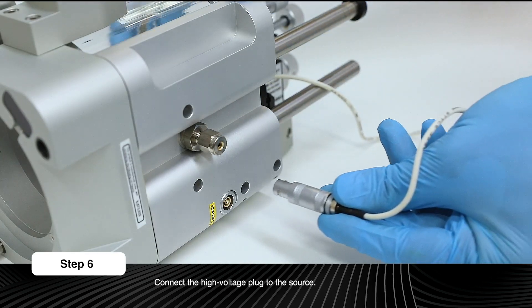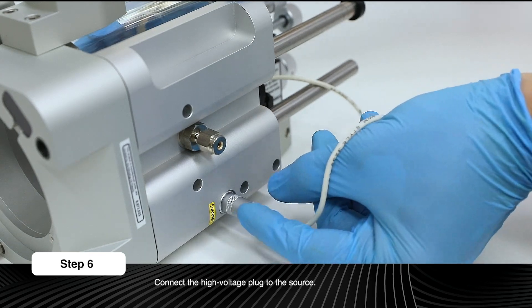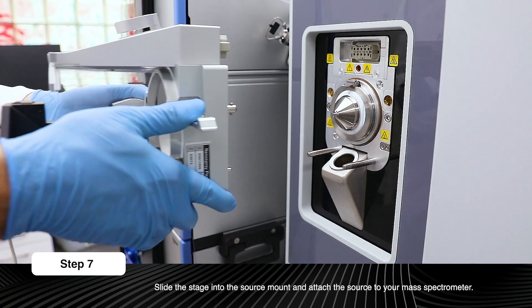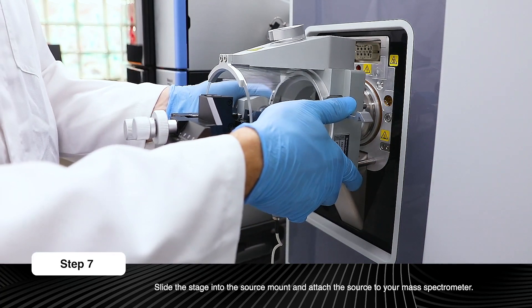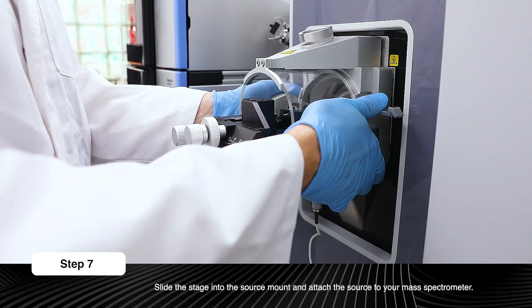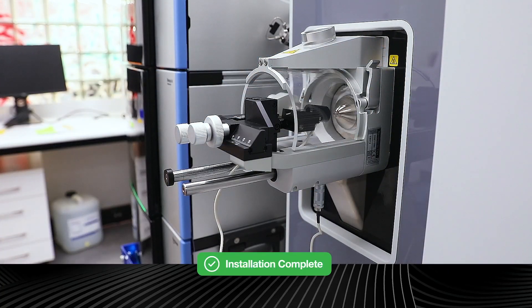Connect the high voltage plug to the source. Slide the stage into the source mount and attach the source to your mass spectrometer. The Nanospray Flex Adapter is now installed and ready for use.